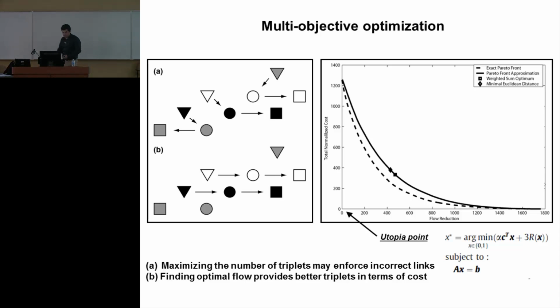And then, in this one, how are you computing the flow? What you said on the x-axis you have flow. The reduction of the flow. So at the very end of it, here, we have the maximum flow. So in this case, it will be 3. All the particles are linked with particles in the next frame. And then here is the no flow. I mean, it's here, sorry, I made a confusion. This is the horizontal, here is the flow reduction. So we have the flow reduction of 100% here, so we have no links and no cost.